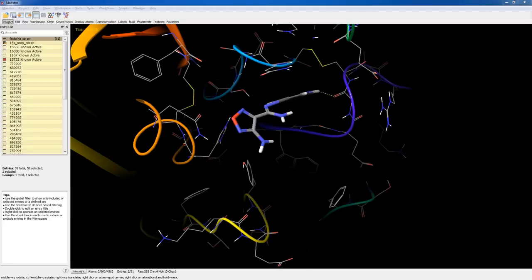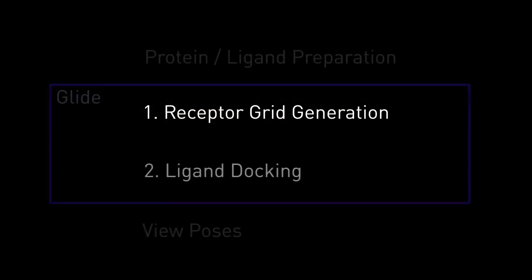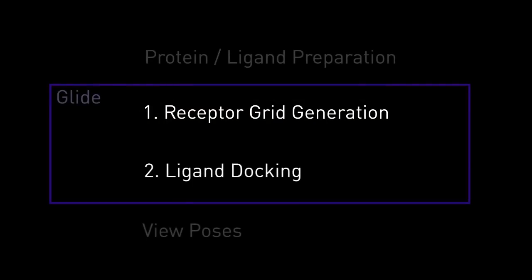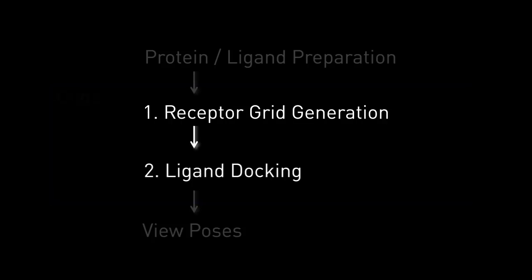Grid generation can be thought of as the first stage in setting up a ligand docking job, as the ligand docking cannot be performed until the receptor grids have been generated.